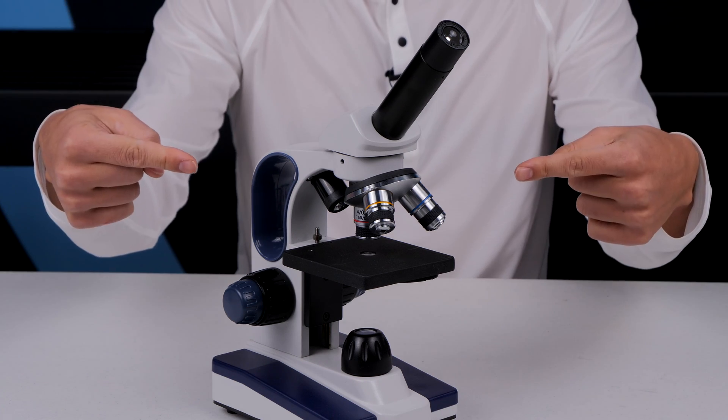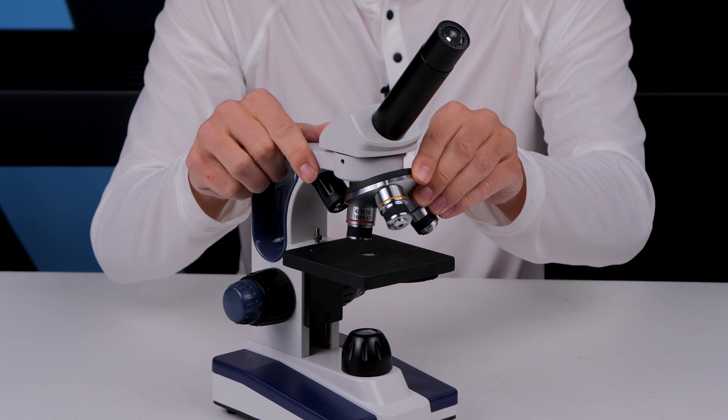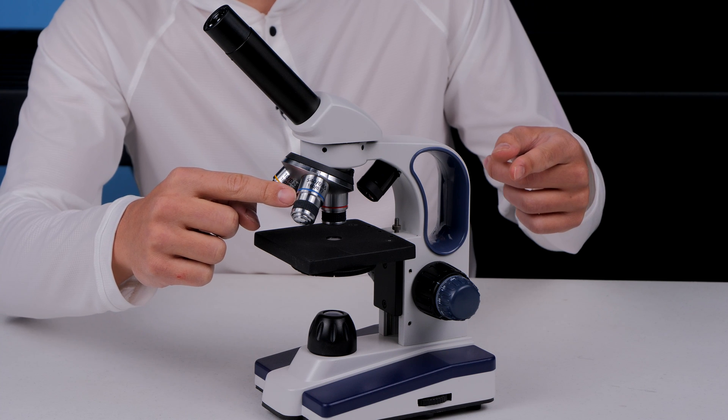You are going to need a compound biological microscope — the kind that has single objectives on a rotating turret. Your compound biological microscope is going to need a 40x objective.